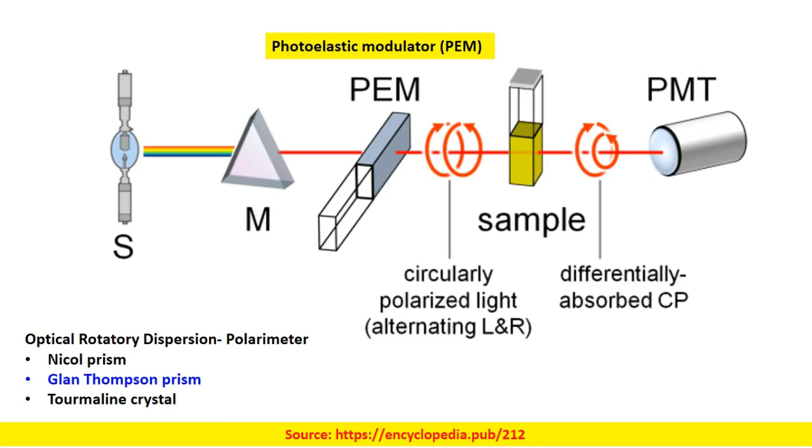Now, let's look into the mechanism, or the instrumentation, of this CD spectroscopy.